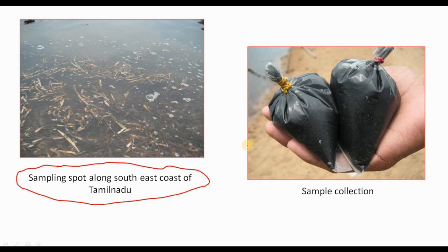See, on the right hand side you are viewing the image of the soil collected from the sampling site. See how the soil is looking. It is very, very black in color. The black nature of the soil is due to rich carbon content. Right? So this is a very good sample for microbiological examination. You should collect the sample in an aseptic way, so that there will not be any entry of organisms from our side. Whenever you are collecting a sample, and wherever you are going, collect the sample in an aseptic pattern. This is very, very important in microbiological analysis.